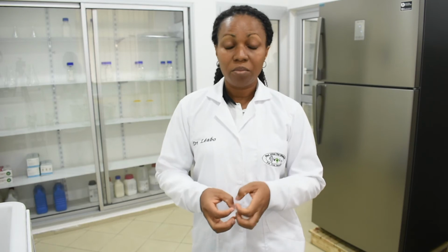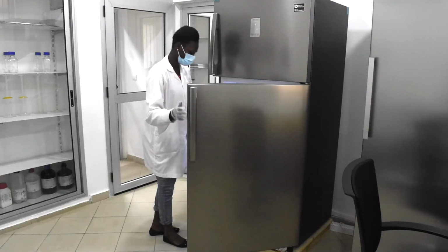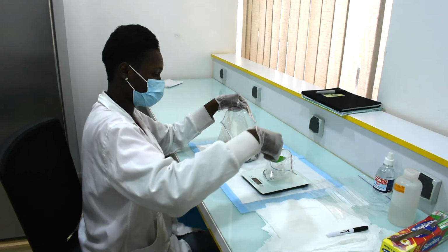Composite soil was sampled from each field and brought to the lab here at WAVE HQ, at the VSM lab, and stored at 4 degrees. After 1 month, soil spores are extracted from this soil in order to identify the species, but also to run trap culture for further analysis.